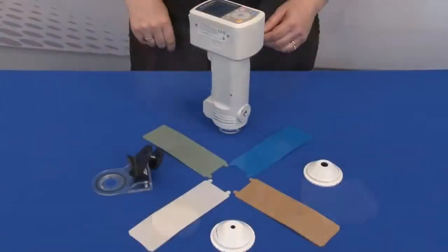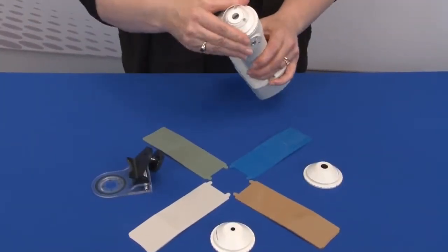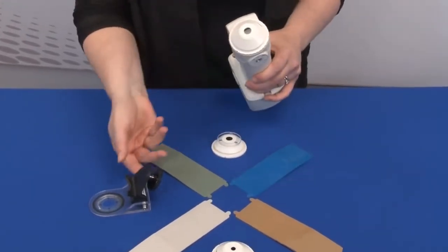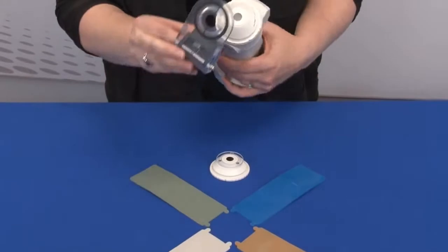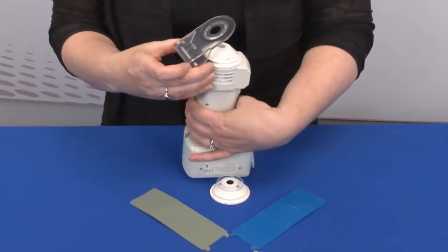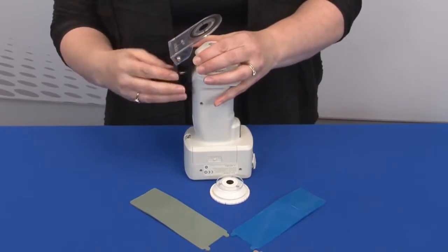Next we will look at the custom pivoting base with a 3mm and 8mm target mask. This accessory is recommended for the measurement of flat samples. The large base plate increases the stability and the marked target area provides precise positioning.